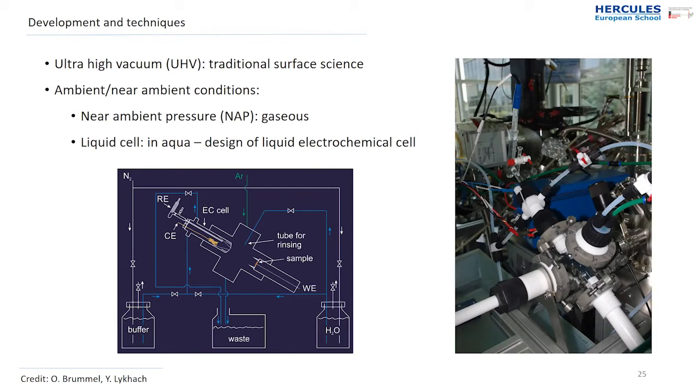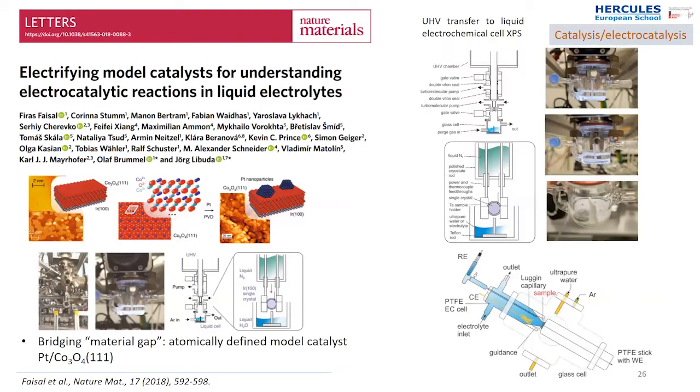But we conducted such an experiment, and again, this was a very huge work. You can see how many people were actually participating. It combines work from the synchrotron, from the materials science beamline in Elettra, in Trieste, Italy. It also combines the work from a German group from the University of Jülich, and partly, of course, from our department, where you really have a glass electrochemical cell.